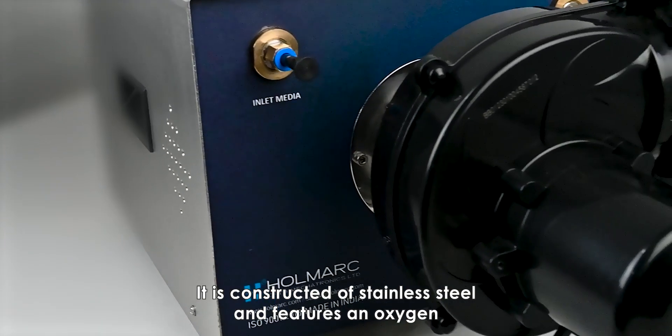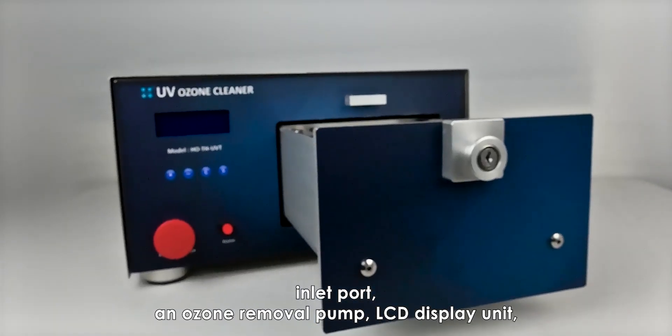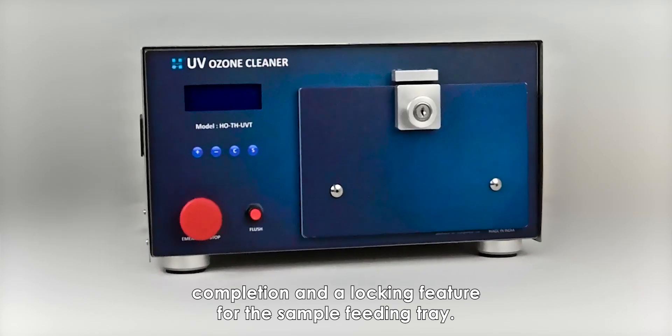It is constructed of stainless steel and features an oxygen inlet port, an ozone removal pump, an LCD display unit, a sample temperature measurement feature, a buzzer for cleaning completion, and a locking feature for the sample feeding tray.